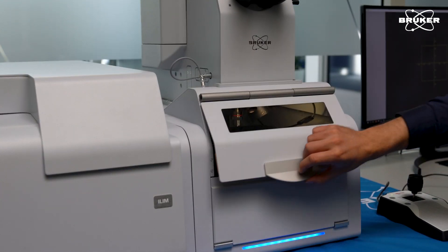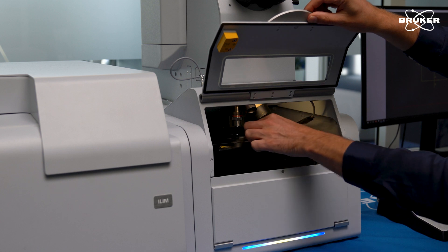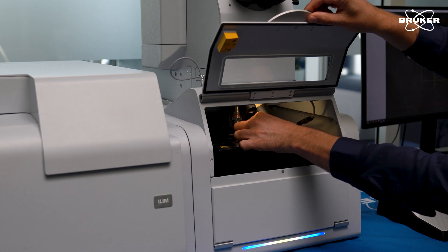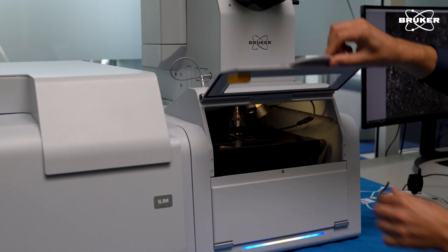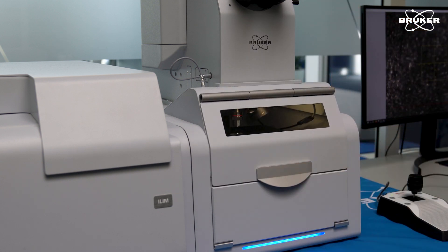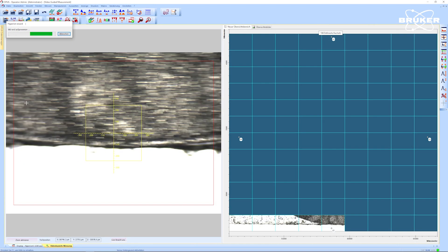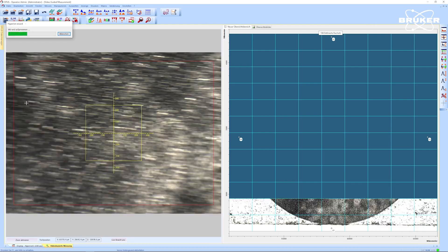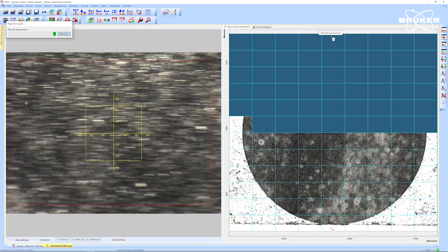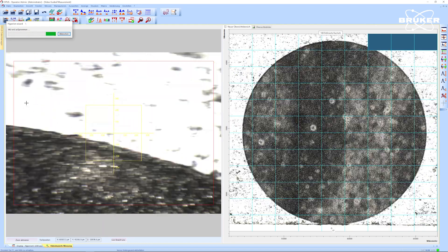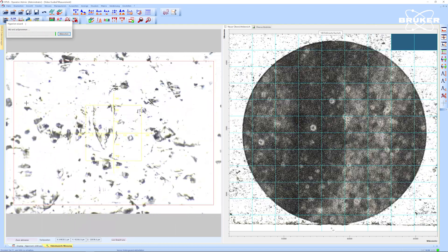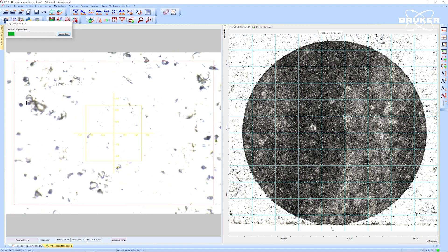The sample is fixed to a glass slide and placed under the Hyperion II infrared laser imaging microscope. We follow our step-by-step software guide, creating a visual overview image for reference in the process.